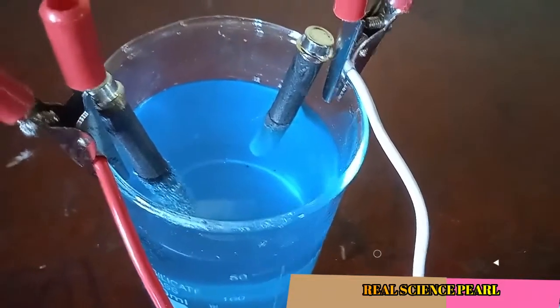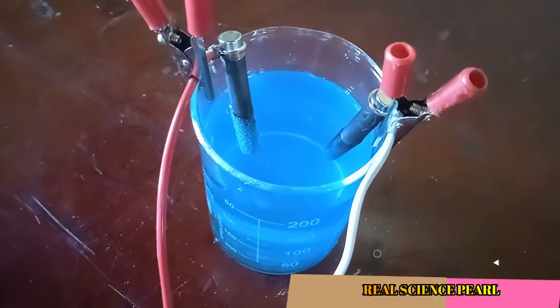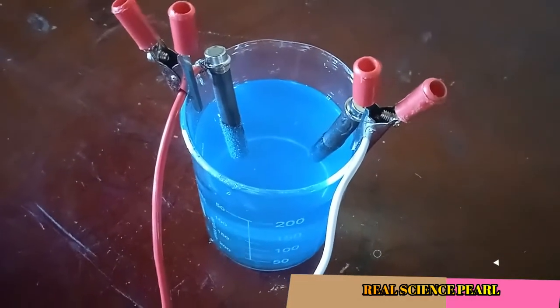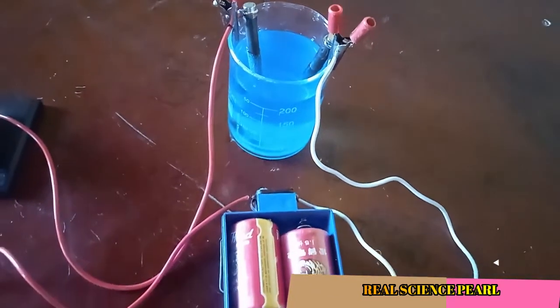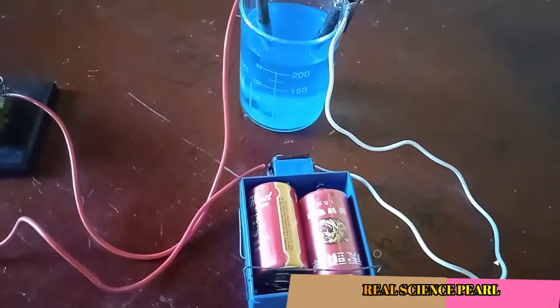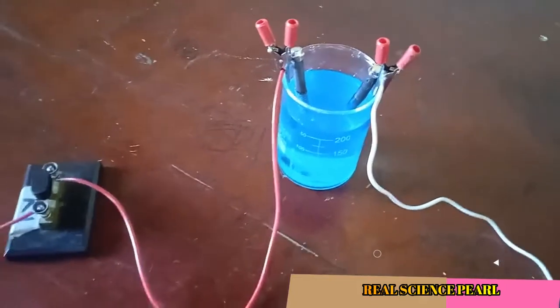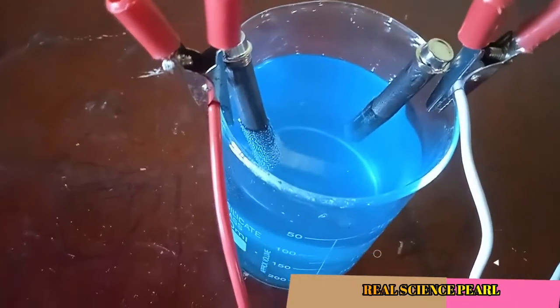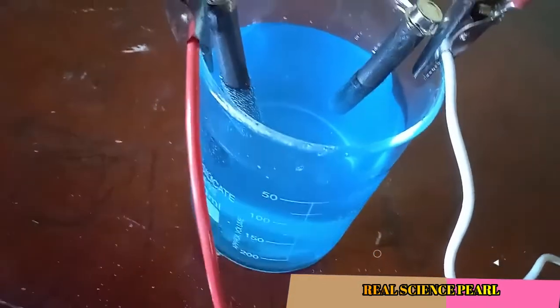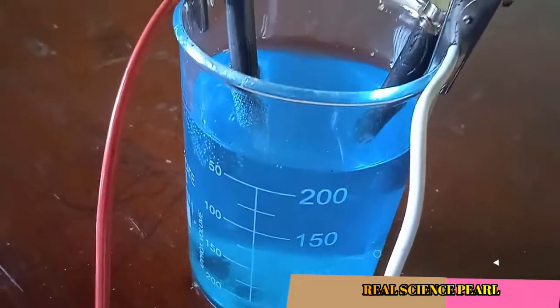So we are seeing that at the anode, this side, we are seeing the bubbles. Where you see the bubbles, that is the anode, and those bubbles are bubbles of a colorless gas, and that is our oxygen being formed there. And we don't happen to see any bubble at the cathode, because what is formed there is not any gas. And when you consider the position of these elements in the activity series, you know that copper is below hydrogen, so we cannot discharge hydrogen at the cathode, but we shall discharge copper preferentially, in preference to hydrogen.